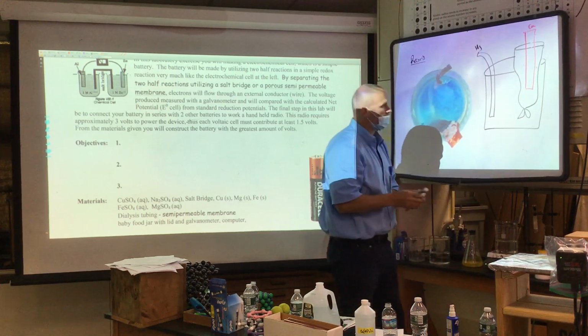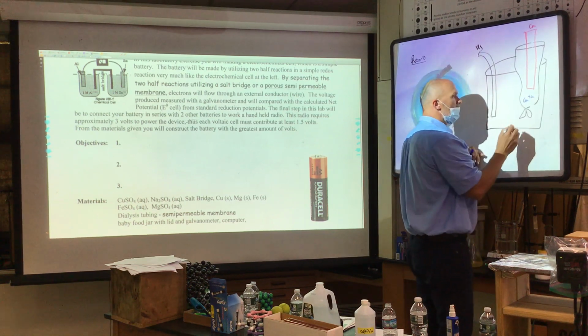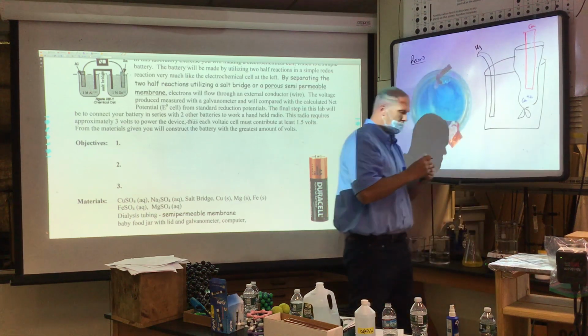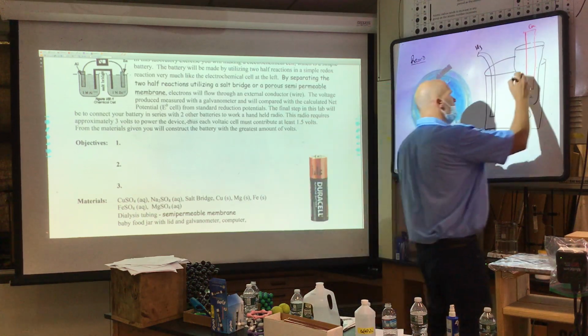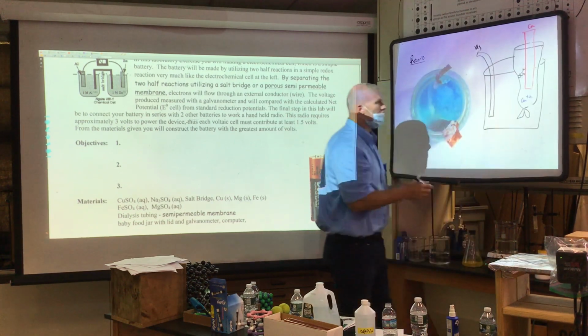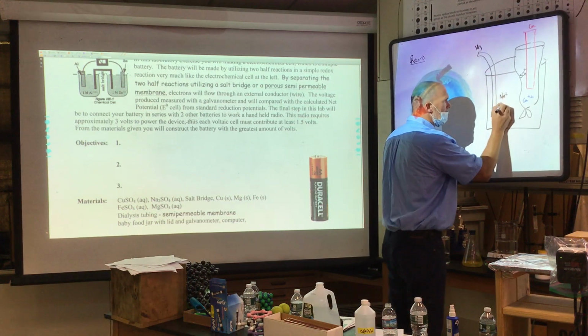Of course, the blue solution is that I had copper ions, copper +2. And because I used copper sulfate, I also had sulfate ions, which I'll write without a color, SO4 -2. In this beaker, I added sodium sulfate, which we should all know is sodium, and SO4 -2.